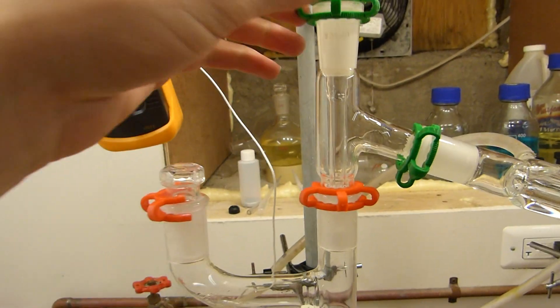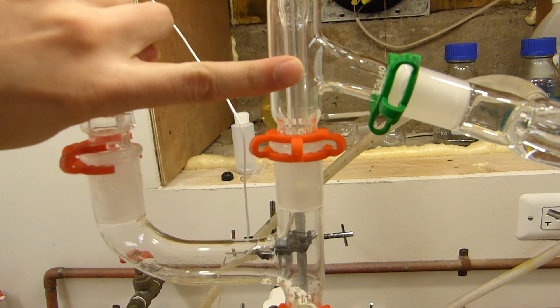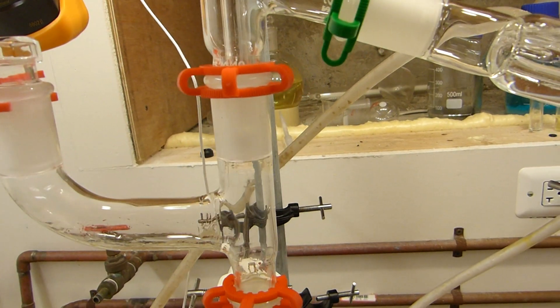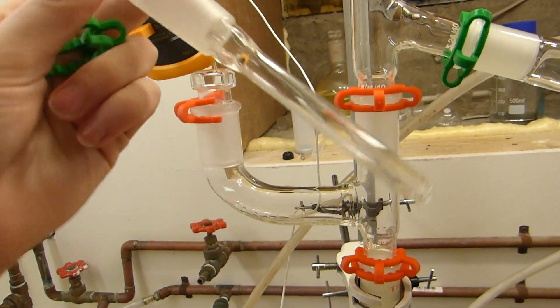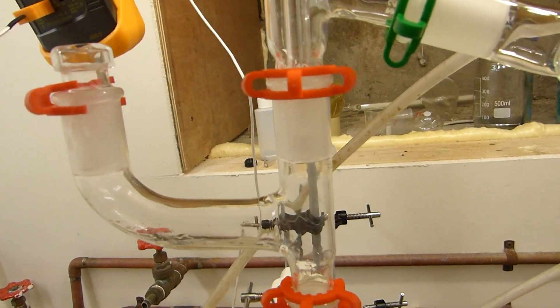And then I guess the last aspect is taking the temperature of what's coming over. Typically you'd have a thermometer adapter up here and the thermometer would extend down and the bulb would be pretty much even with where the vapors get taken off. I have here this special thermometer well. It's like a test tube essentially, and that sits down in there like that.